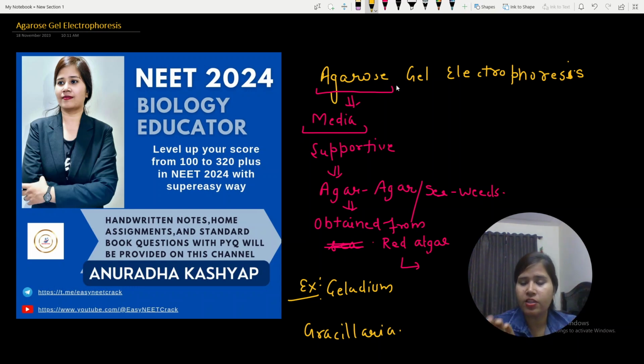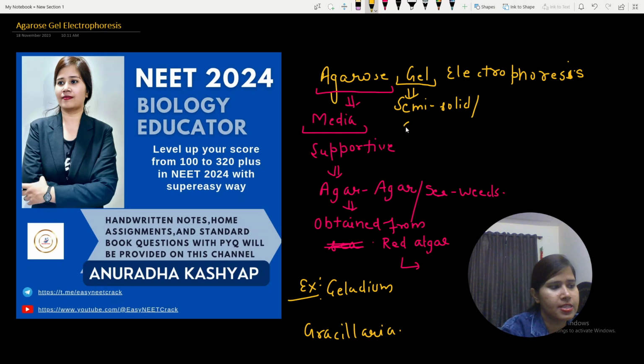So basically, what is a gel? Gel is a media, or a compound. Gel is not as much solid and not as much liquid. So it is a consistency like honey. Gel is basically semi-solid, and you can say it's semi-liquid kind of thing, right?